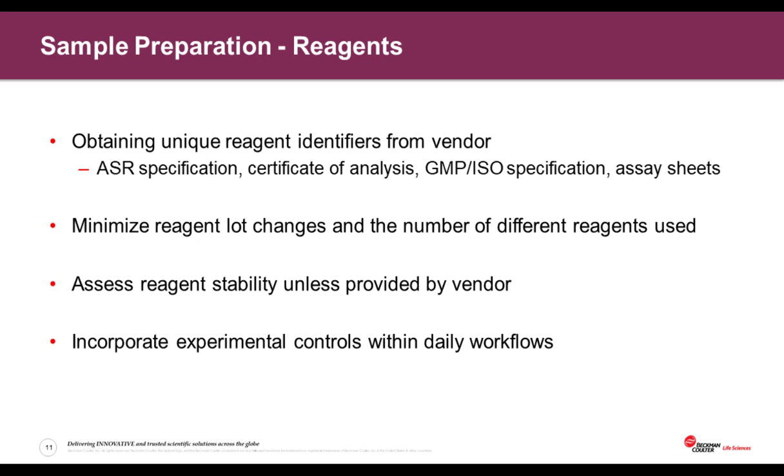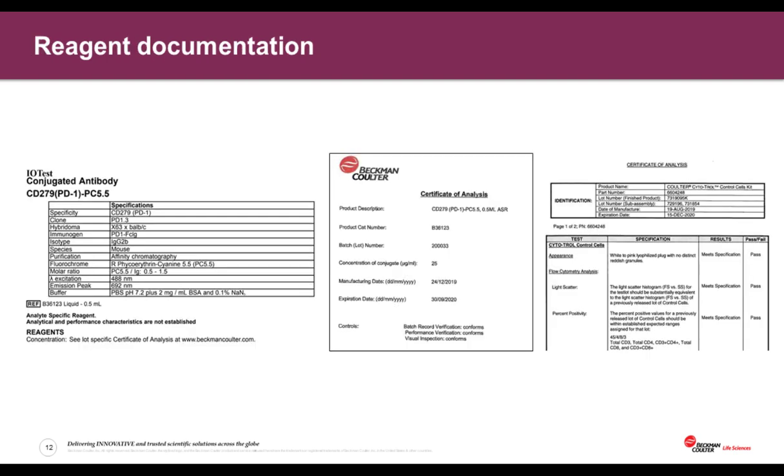And lastly, and most importantly, we're always going to incorporate experimental control within our daily workflows. This experimental control is the QC to our entire workflow, much like the QC of the instrument and the QC of the reagent that comes with specifications. So we're going to discuss this in a little more detail.